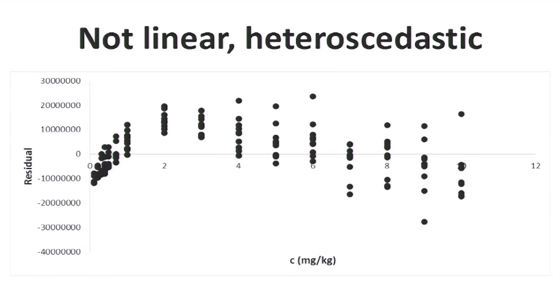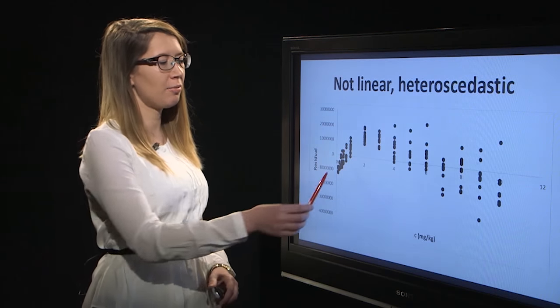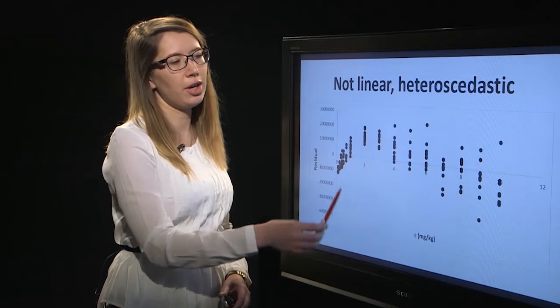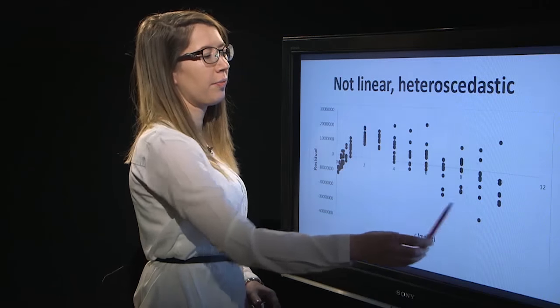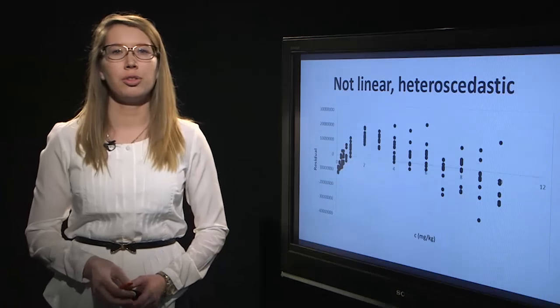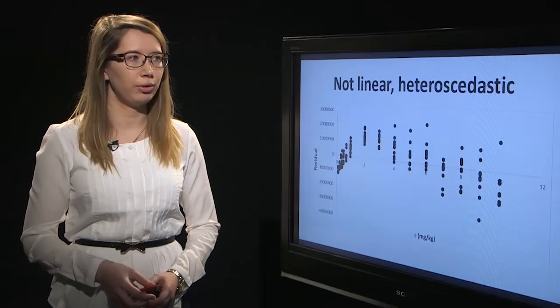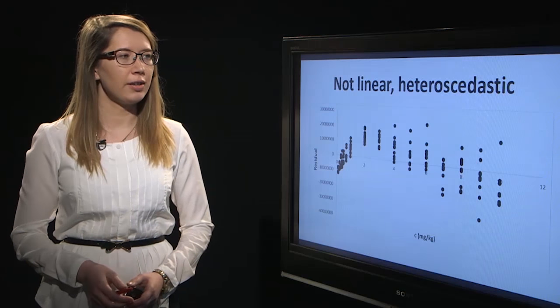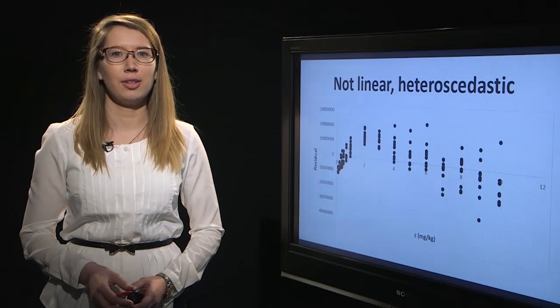When our calibration graph is not linear, we can see a systematic placement of the residuals on this graph. The residuals have the same sign at lower concentrations and higher concentrations and the opposite sign in the middle part. Therefore, we shouldn't use a linear regression model. Also, we can see the heteroscedasticity on this graph.